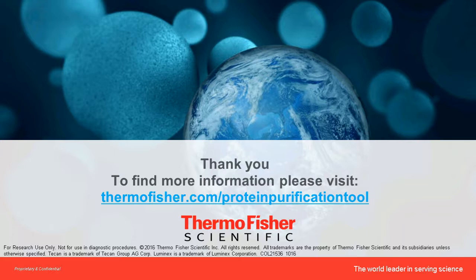Excellent. Thanks, Bhavin. And just following on from that, do you know if there are any white papers that describe IP-MS methods directed to protein targets identification and the methods and the reagents for each step? Is that any sort of information that you can give with that?